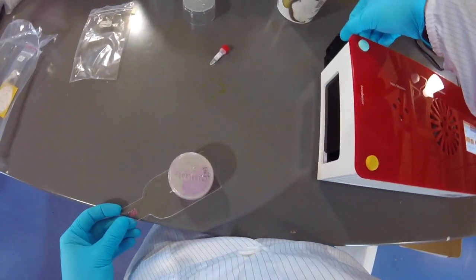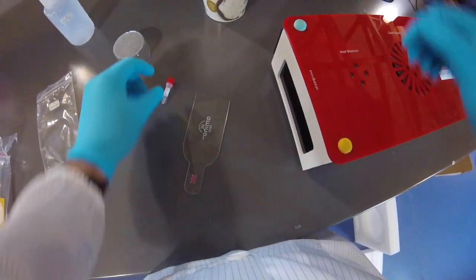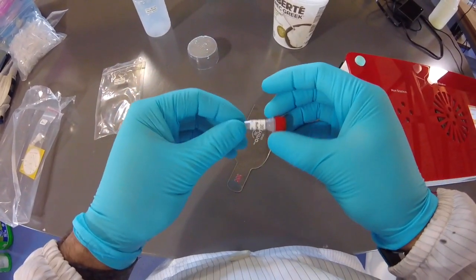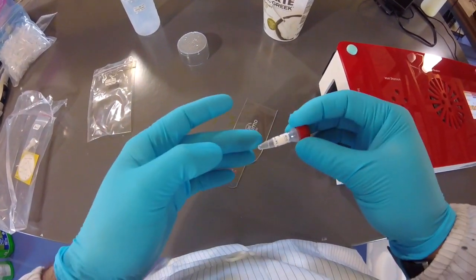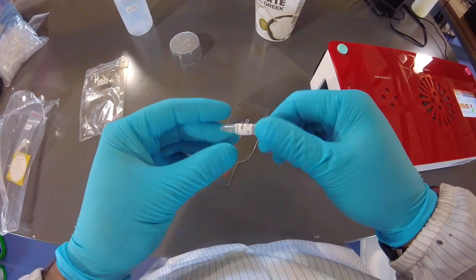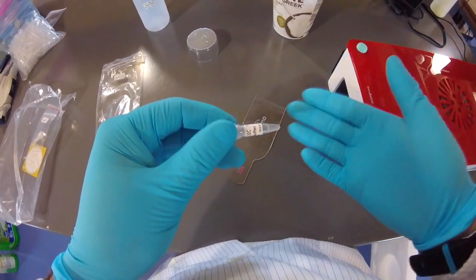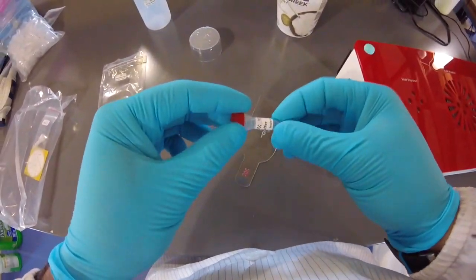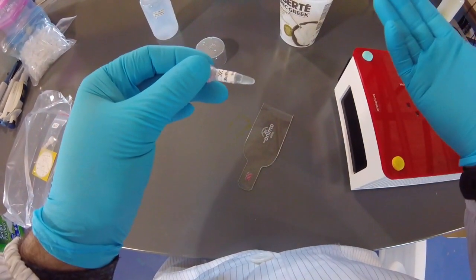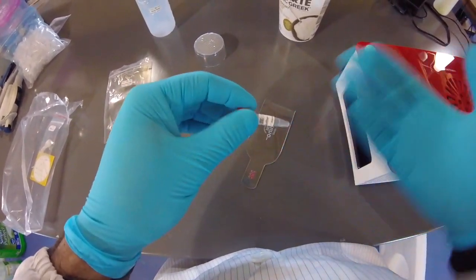Let's put that. Lock the incubator. So now that we got what seem to be some really good results, we don't really have any need for this tube, though it still likely has some engineered cells in it, right? This was our tube that we recovered our heat shock cells in, and typically it's good to hang on to that until you see a result. So if there were no colonies on the Petri dish, you could always pour the remainder of this onto your selective plate and incubate it longer, because maybe there are still some engineered cells in here that just didn't make it onto your plate.